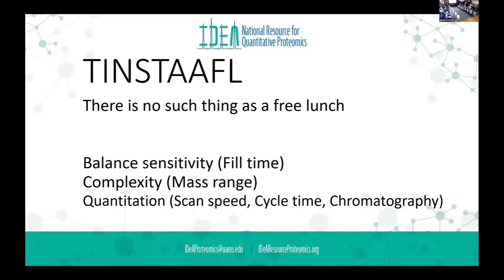I'm anxious to see, so hopefully we're going to get an Astral soon. Anxious to see what the ion capacity is in the Astral and the TOF, to see how it affects taking larger windows. And you're going to hit the ion limit sooner with a wide window isolation.